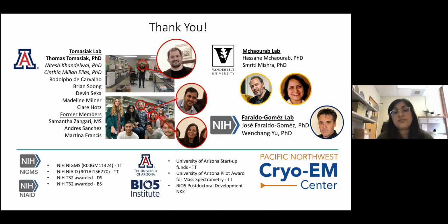So the extracellular domain of BmrCD is uncharacterized in terms of what its function is. This is the first structural characterization of that region. As far as we can tell, there is no other structural homology within ABC transporters that I was able to find, in the absence of related structures that look quite like that domain.